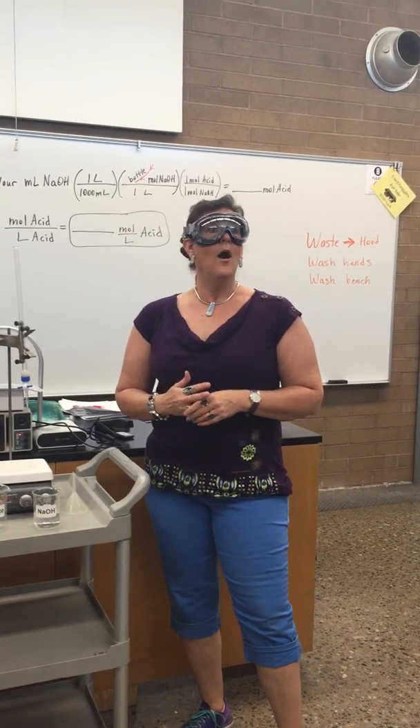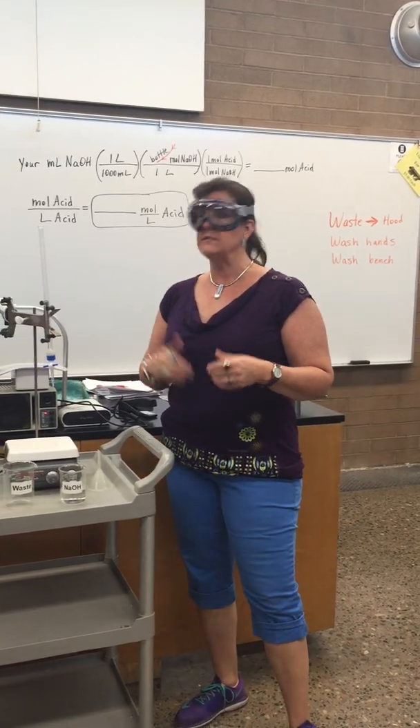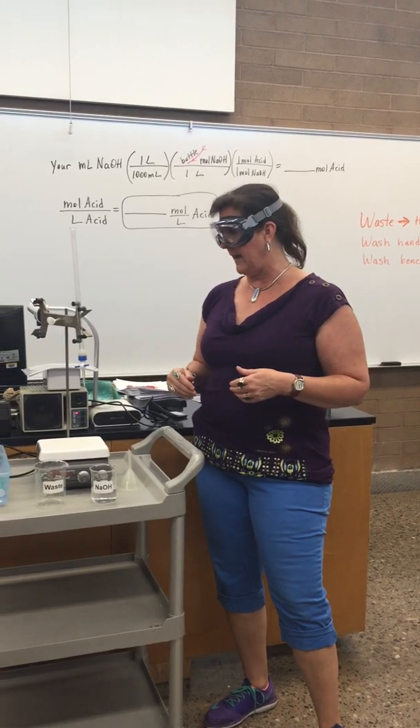I'm going to tell you how to prepare your burette with sodium hydroxide for today's Chem 130 lab, which is the titration of vinegar and sodium hydroxide.